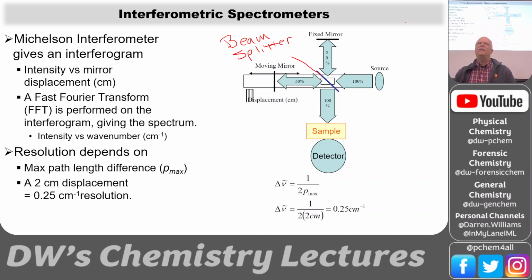And you may wonder, how does it do that? Well, they take a salt window and they just sputter a little bit of aluminum on it. And they measure how much goes through. So they sputter a little bit, and then they measure it, and they sputter a little bit more. And so then they know how long to sputter aluminum on this surface to make a 50-50 mirror. That's their business, so they're really good at it. So they make a 50% beam splitter. So half the light goes up, half the light goes through.